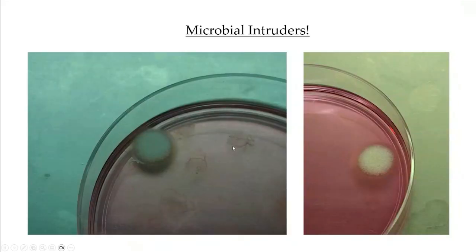And this is what can happen despite having an antifungal additive such as amphotericin. These are monkey slices, and you can see they're circular here, not the nice crescents that you get from mice, because we use the coring tool for this. What happened was a fungus grew on top of the slices.